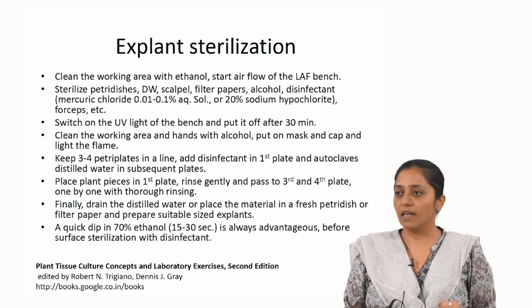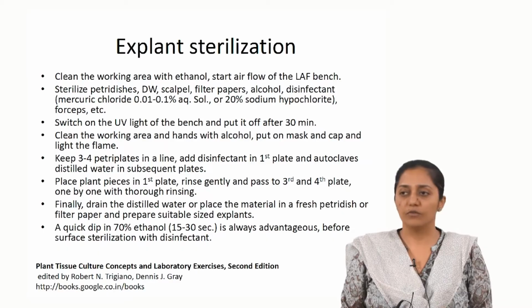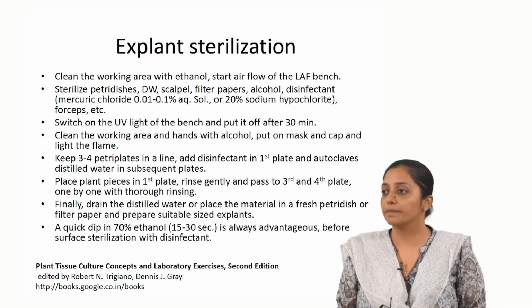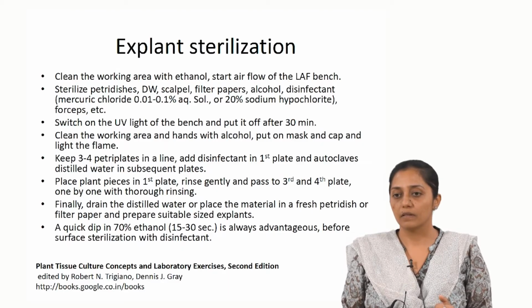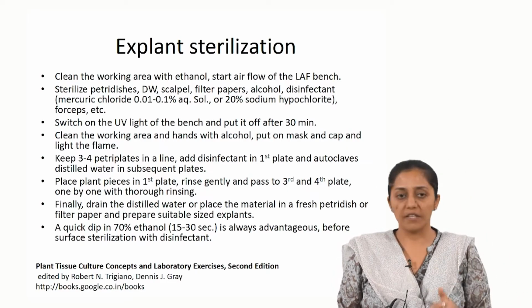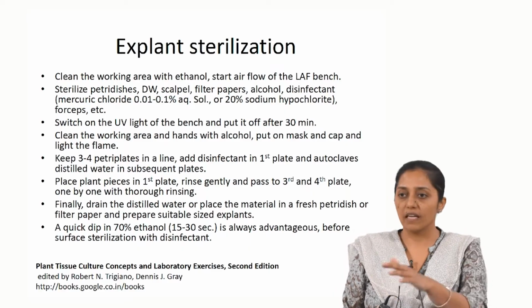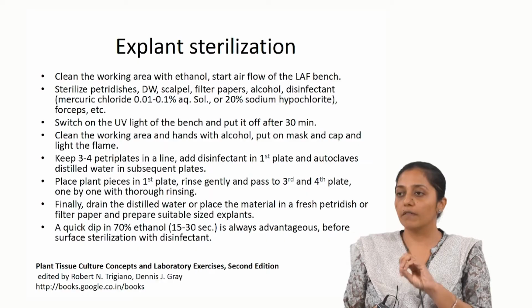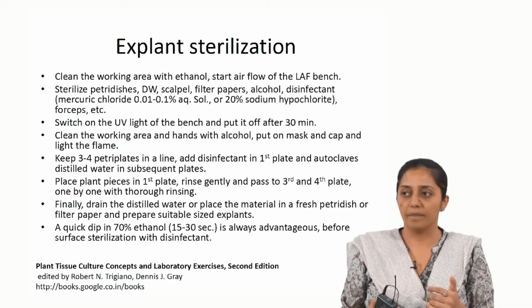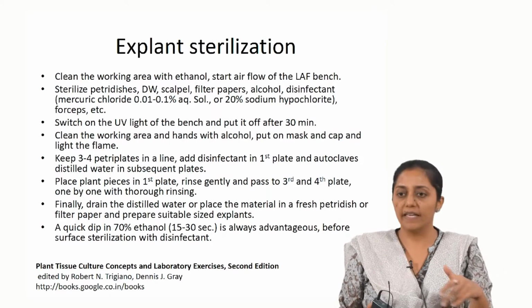Now, what is the laminar hood? Have you used a LAF? Yes. So, what is LAF? Laminar air flow. Why do we use that? Either there is a horizontal flow or a vertical flow. How is it maintaining the aseptic conditions? How is positive pressure being created? There is a HEPA filter through which sterile air is pushed in through the mesh at high pressure, so that there is a positive airflow outward from the LAF and a sterile environment inside. While working in the LAF, it is always preferred to work behind the flame, or close to the flame, because around the flame the probability of a sterile environment is higher because of the heat generated.